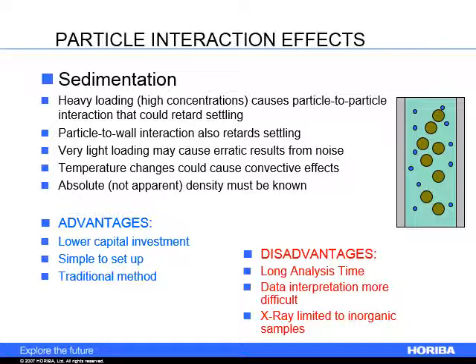I'm going to be brief on this one. This is the end point of the sedimentation we just spoke about. As you have your loading in your solution and you go to measure this by X-ray sedimentation, which is the most common one that I'm familiar with, depending on the loading of your solution and the temperature change, you need to know density stuff. There's a lot of information you need to get sedimentation to work.